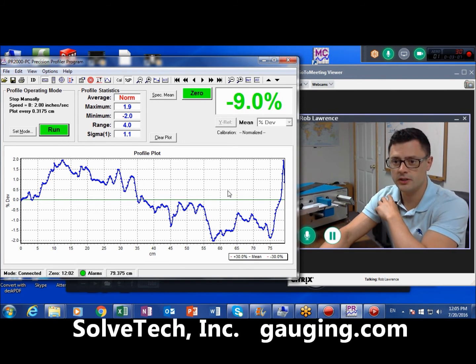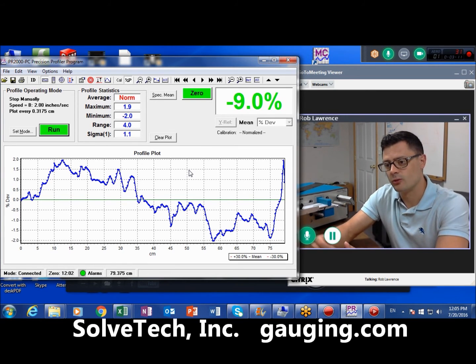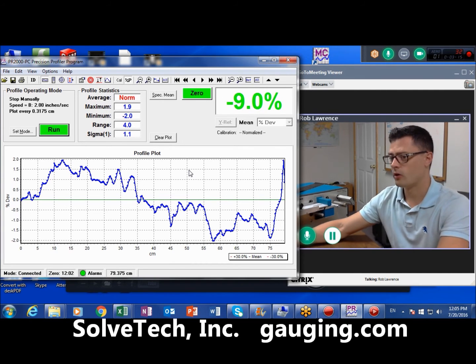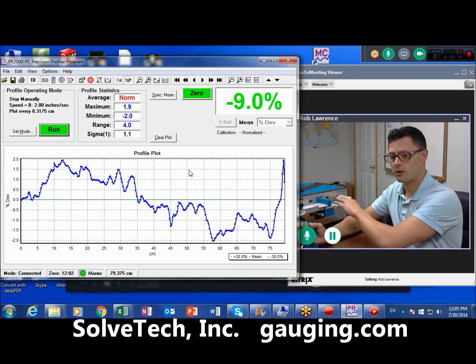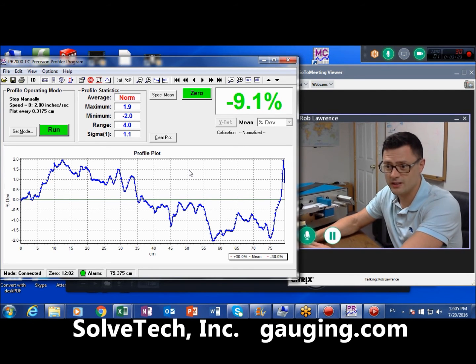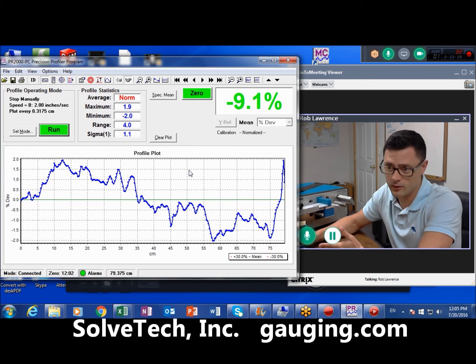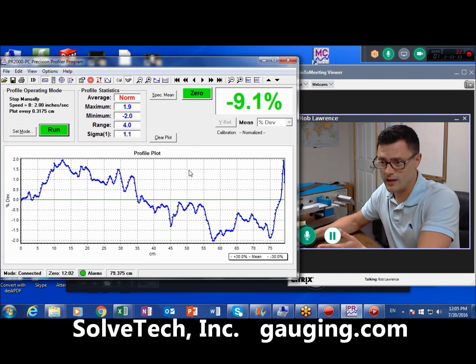Now, in terms of the precision of the instrument, you want to always be 10 times what you think you need in order to get a reliable reading. When you do an R&R, when looking at material variability using a micrometer versus doing an R&R using a non-contacting gauge, this is about 60–70% R&R, and this is about 3%. Now you want to be under 10%. If you're above 30%, the device you're using really is not effective.